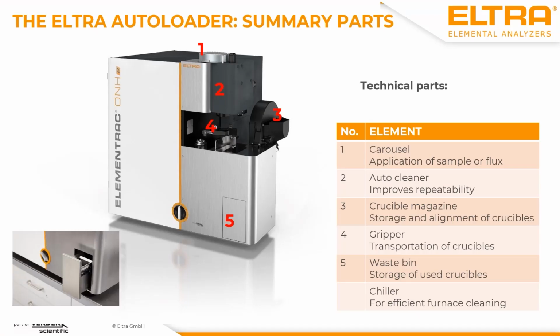I would like to summarize what we have seen in the video. On the one hand, which is marked here with number 1, we have the carousel where you can apply your sample and maybe sample and additional flux. What does this mean, management of flux? I will discuss in the following and in the next slides. Then we have an auto cleaner, which is part of the delivery content of the autoloader, because we highly recommend cleaning after 2, 3, or 5 samples, and this increases the repeatability of all samples you measure.